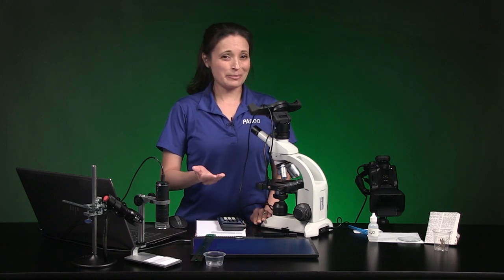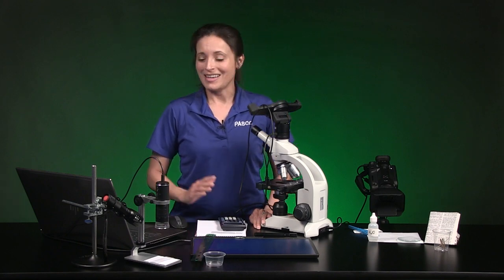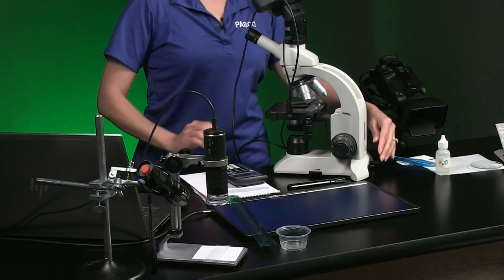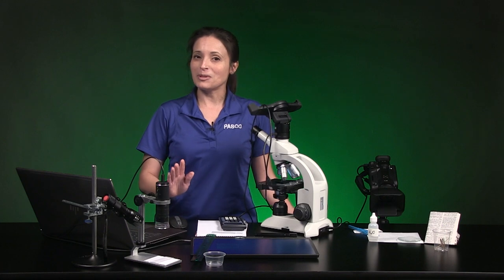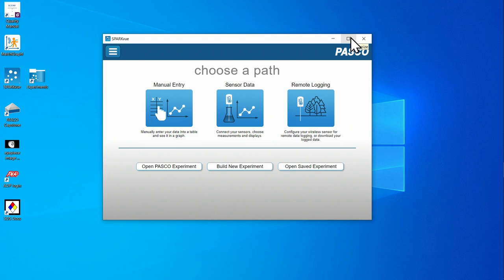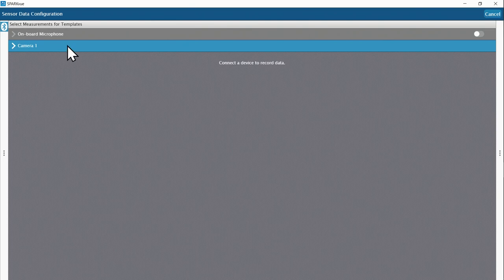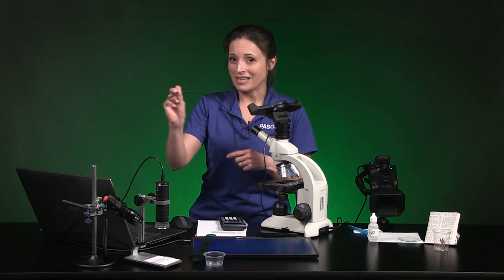There's no actual data collection in part one. This part of the procedure is here for you to learn how to connect a digital microscope in SparkView and options for lighting. Let me turn on the microscope light. All other apps on my computer are closed, so now I can open SparkView. Make sure SparkView is full screen and choose sensor data. I see camera one even though I have not plugged in my digital camera or microscope yet, because SparkView is seeing the built-in camera in this laptop.